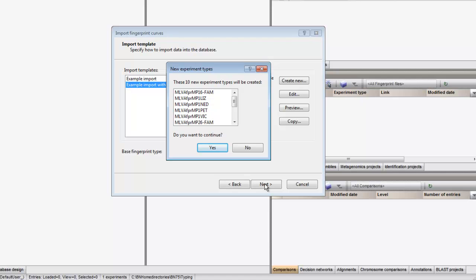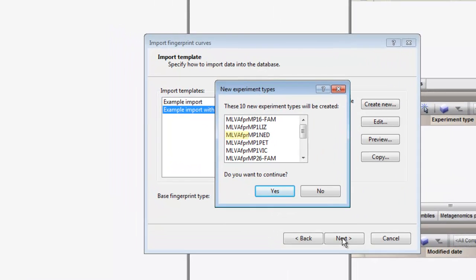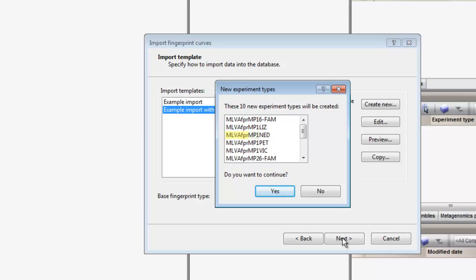For each pool and die combination, a fingerprint type needs to be present in the database. The names of these fingerprint types are composed of the base fingerprint type name, followed by the pool name and the name of the die.